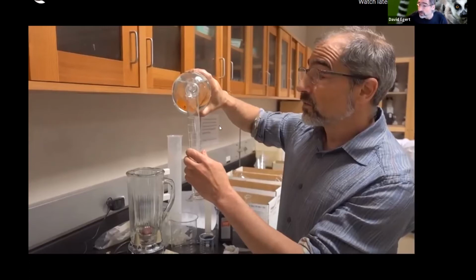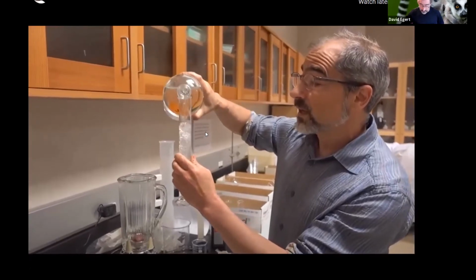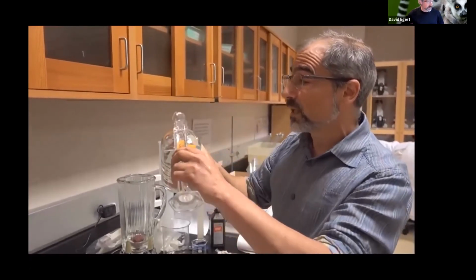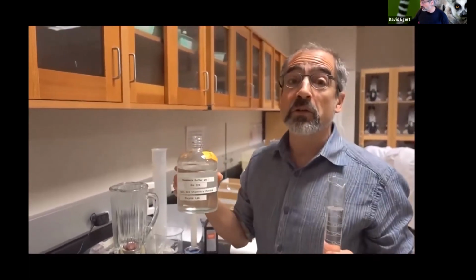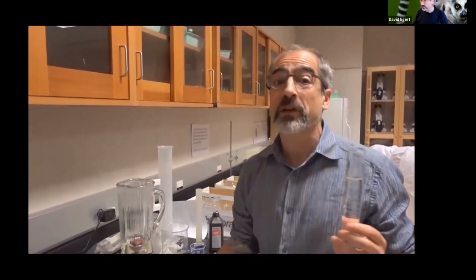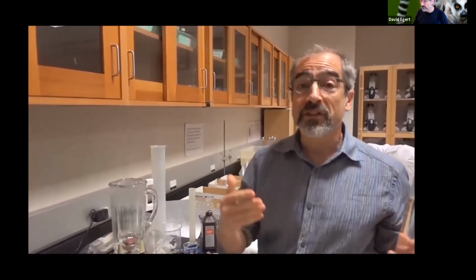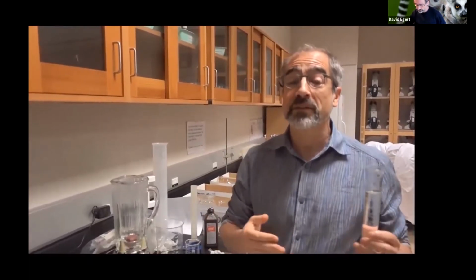So, all right, we'll continue on here. We want to make sure that our enzyme is going to be active, and an enzyme is a protein, so in order to make sure the enzyme is not going to be destroyed, we have to make sure we don't denature the protein. So you have to think about what kind of things denature proteins and would inactivate enzymes.